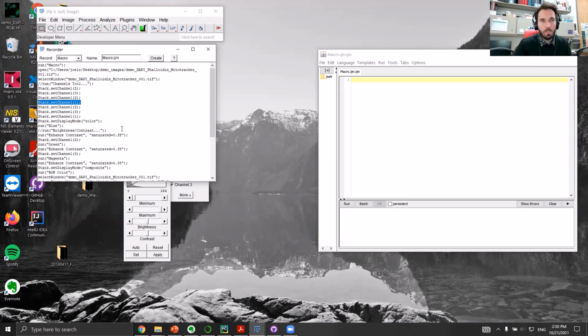Of course, there's always a little bit more stuff, especially when I'm teaching this, because I'm clicking on different things here and there. So we'll just get what's important. Step 1 is to select the first channel. I'll copy paste that. I found that here in my recorder; you may have it elsewhere. That's stack.setChannel and in brackets 1. And then what we did to that channel, we made it blue. We changed the LUT, the lookup table, how the color is encoded, to blue.